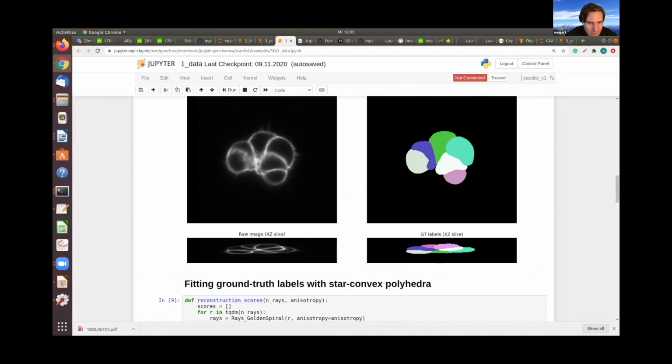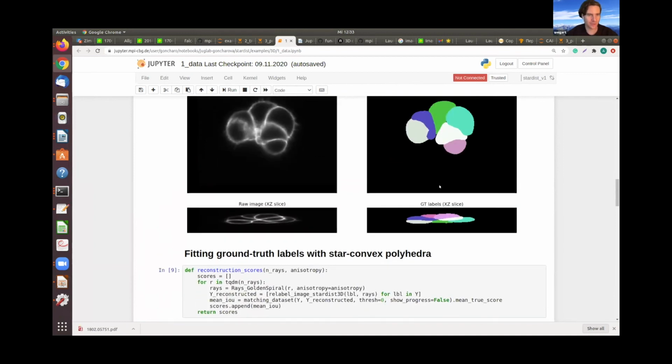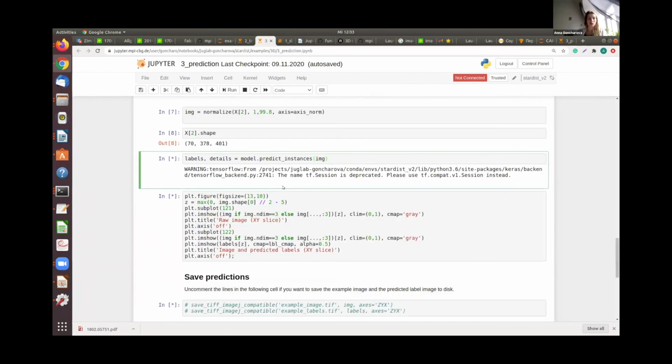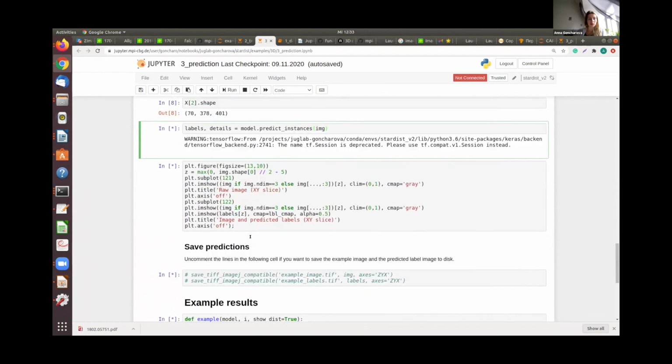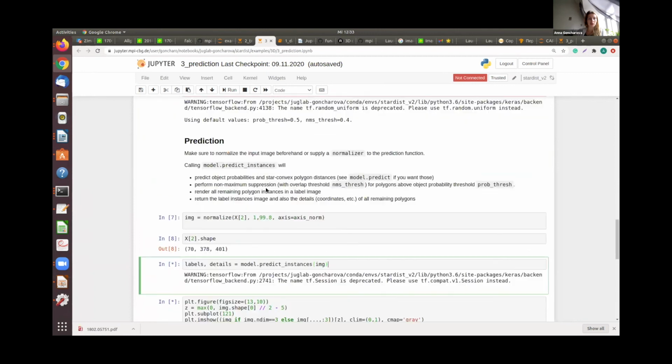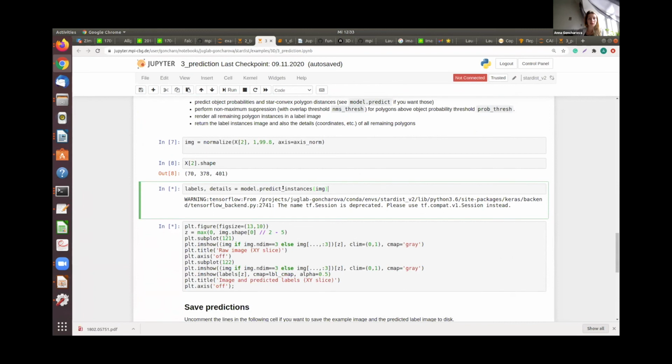Yeah, but these things are probably, so it should just paint essentially the convex part interior of that. So that should work. So what do you see? You just see long prediction times. Yeah, I usually try running it in our cluster, and usually it's super slow. I can download everything, and after that, in predict instances, I have one this morning, and after that there is nothing. Even in error, there is no error, but I was waiting for a few hours.